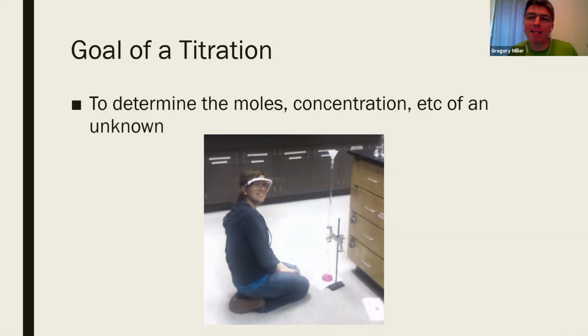Well, if you can't get to eye level, sometimes you can move the Buret down enough to see it. But if you can't, set it on the floor. Sit down, kneel down, do your titration that way so that you can get accurate measurements. That's really what that picture is there for.